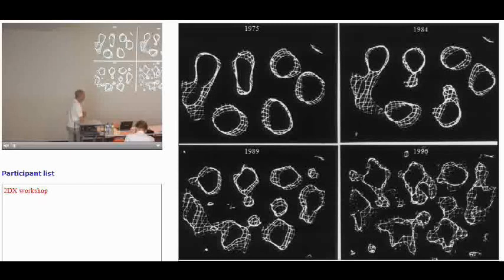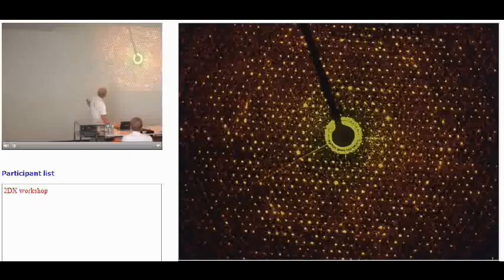But it did take 15 years or something like that. So the single particle stuff is now somewhere in the middle here. But obviously with technical improvements, it's going to get to be quite good as well. Okay, so a few more to flick through.